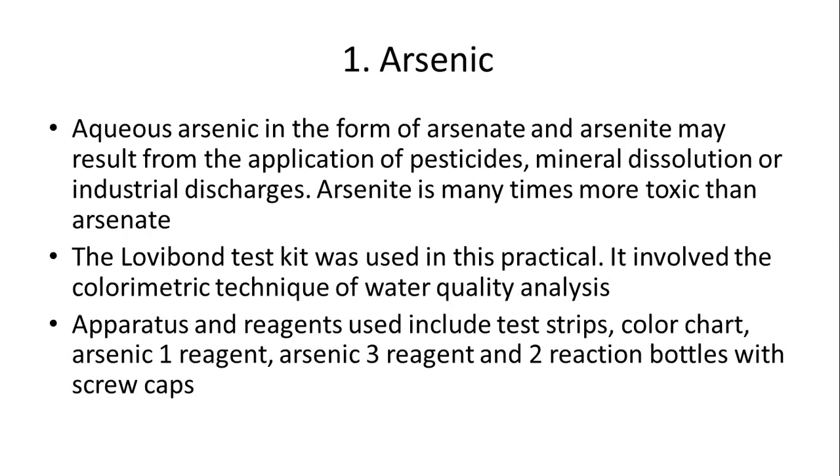So for the arsenic, aqueous arsenic in the form of arsenate and arsenite may result from the application of pesticides, mineral dissolution, or industrial discharges. Arsenite is many times more toxic than arsenate. So the Lovibond test kit would be used in this practical.